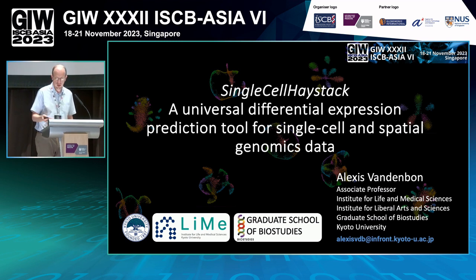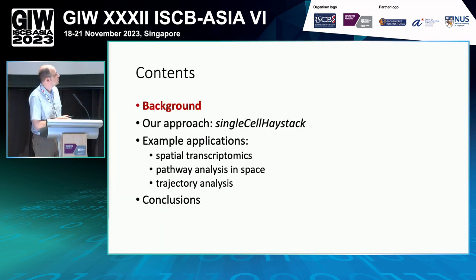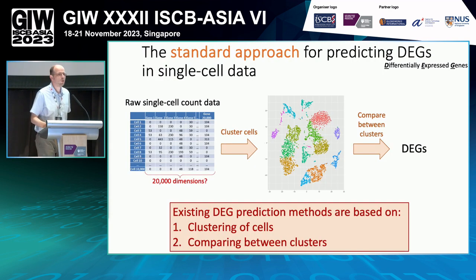Okay, so as he already said, I want to talk about a universal tool for predicting differential expression. So let me start with the background. Maybe you're all familiar with the standard way for predicting differentially expressed genes, or DEGs, in single-cell data.